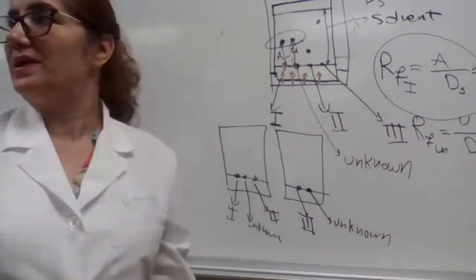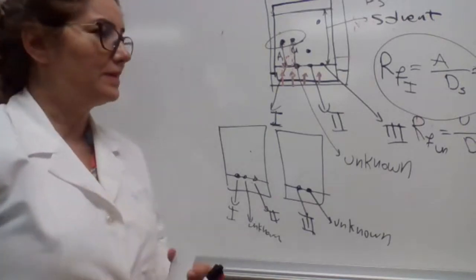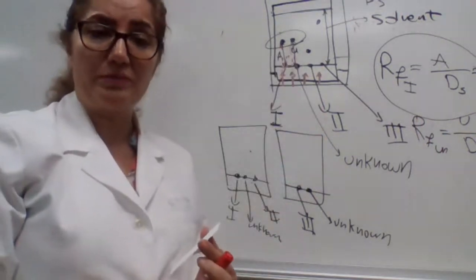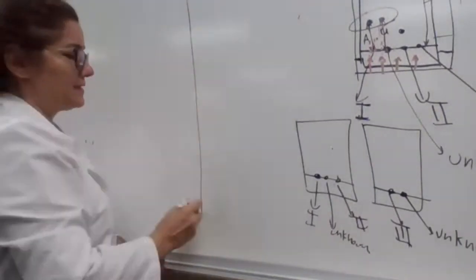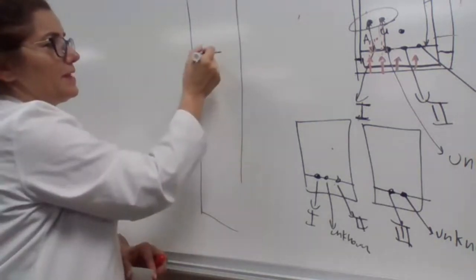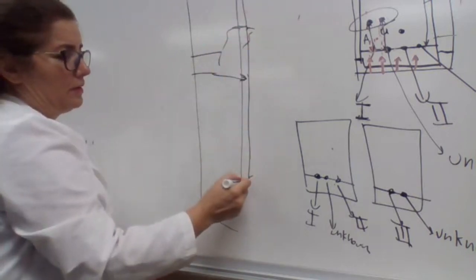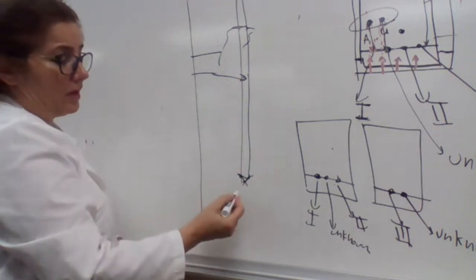If there is no question, I'm going to move on and actually perform the experiment. This is for TLC, and then we are going to set up column chromatography also. With the column chromatography, you have a stand, you have your clamp or the burette clamp that you are going to use to hold the column, and then you are going to prepare the column.